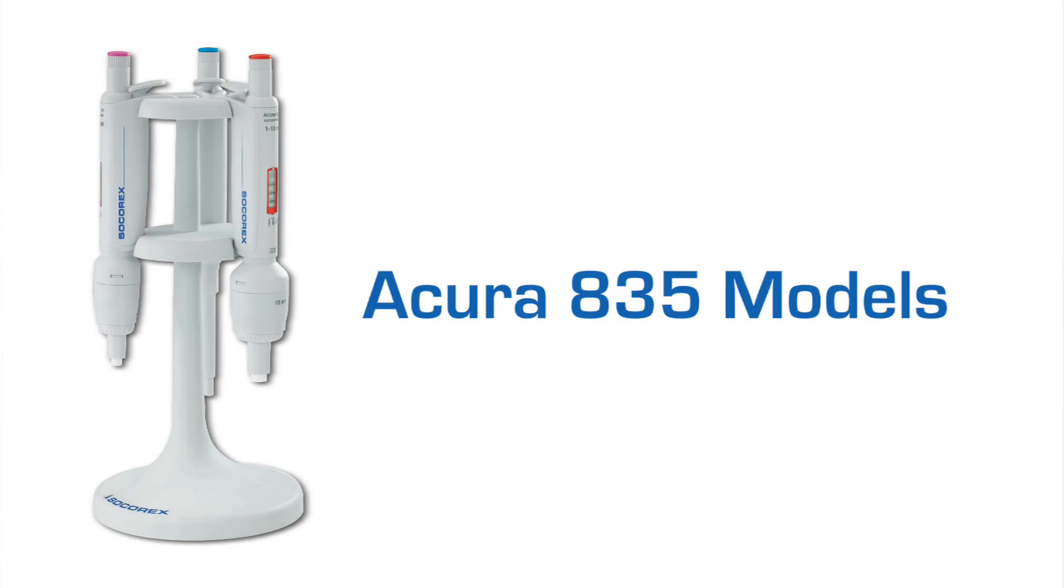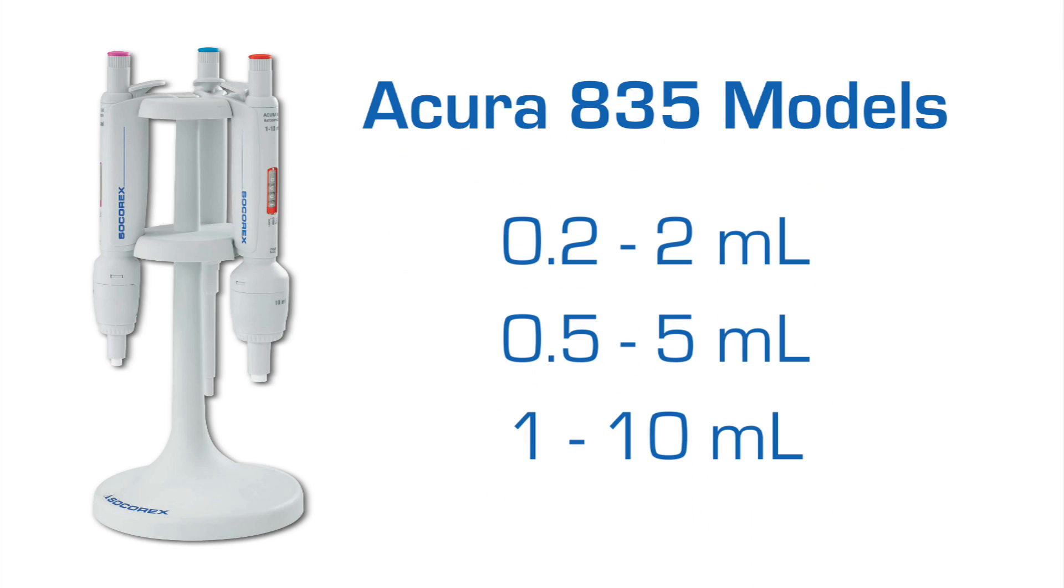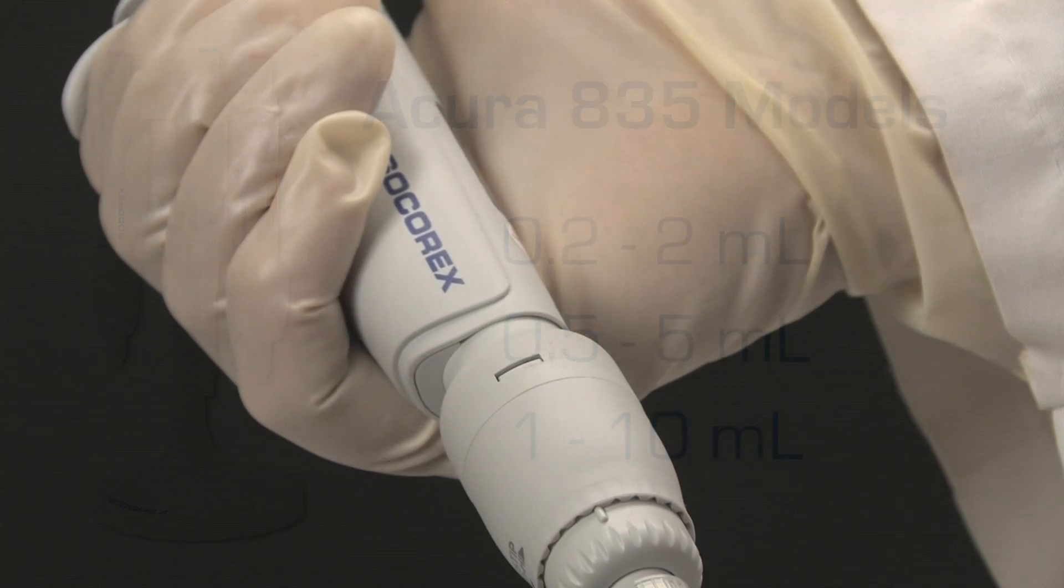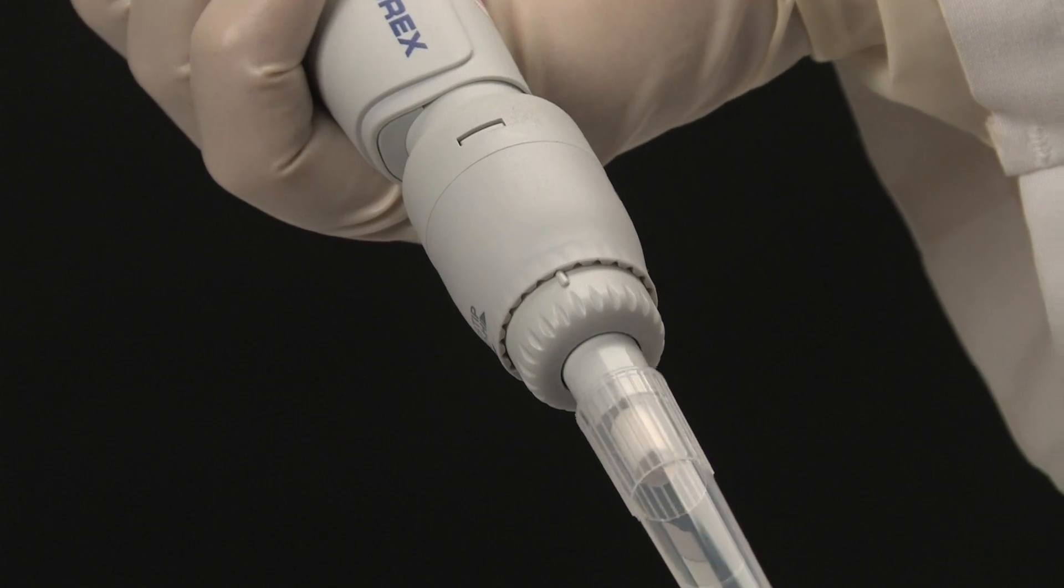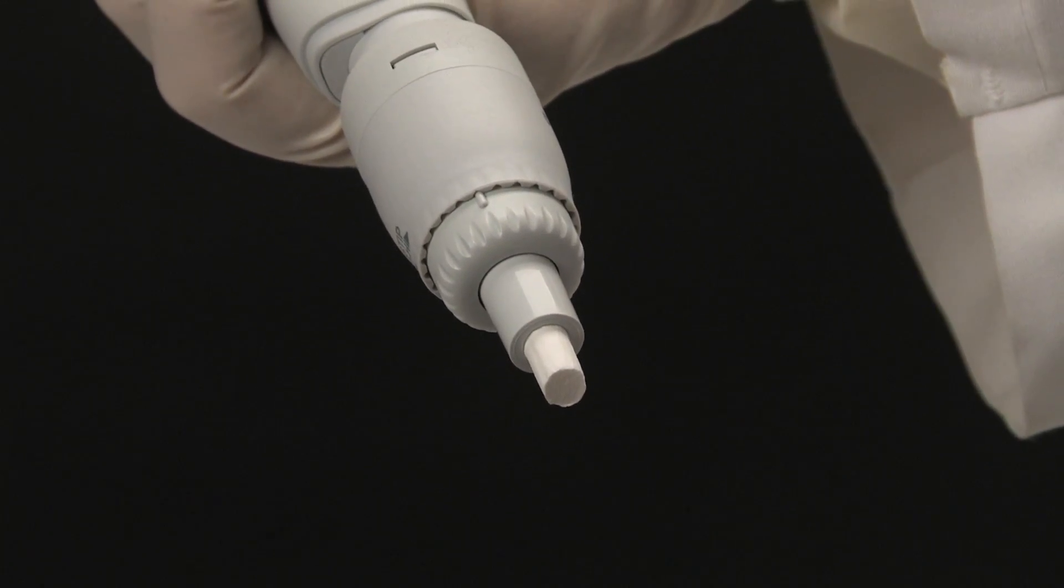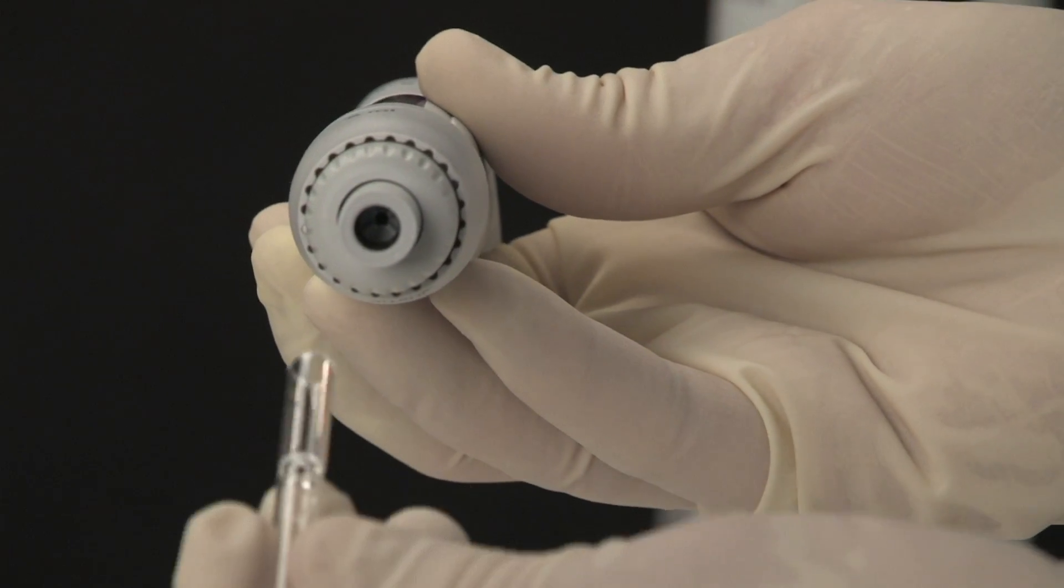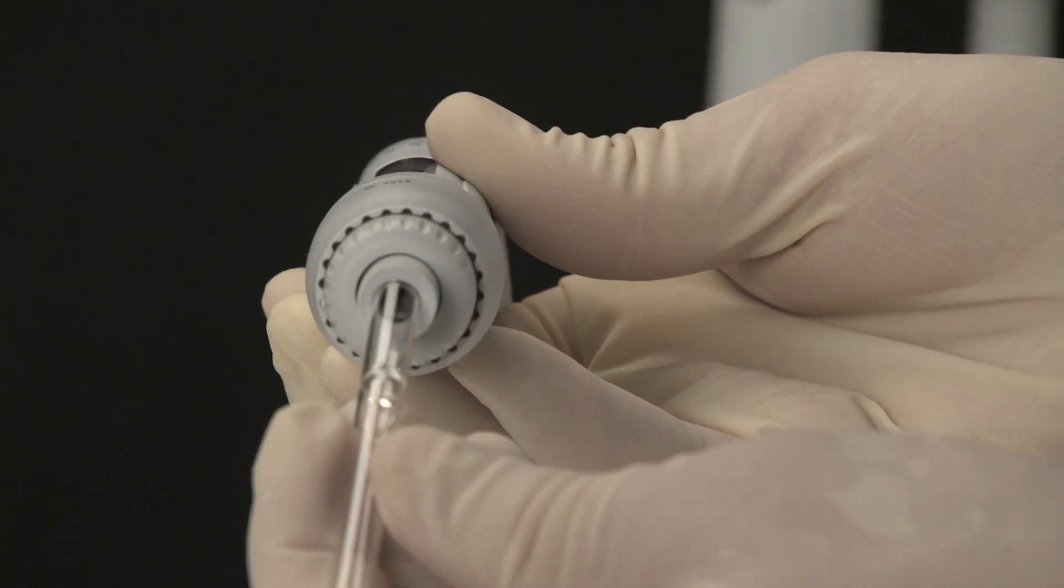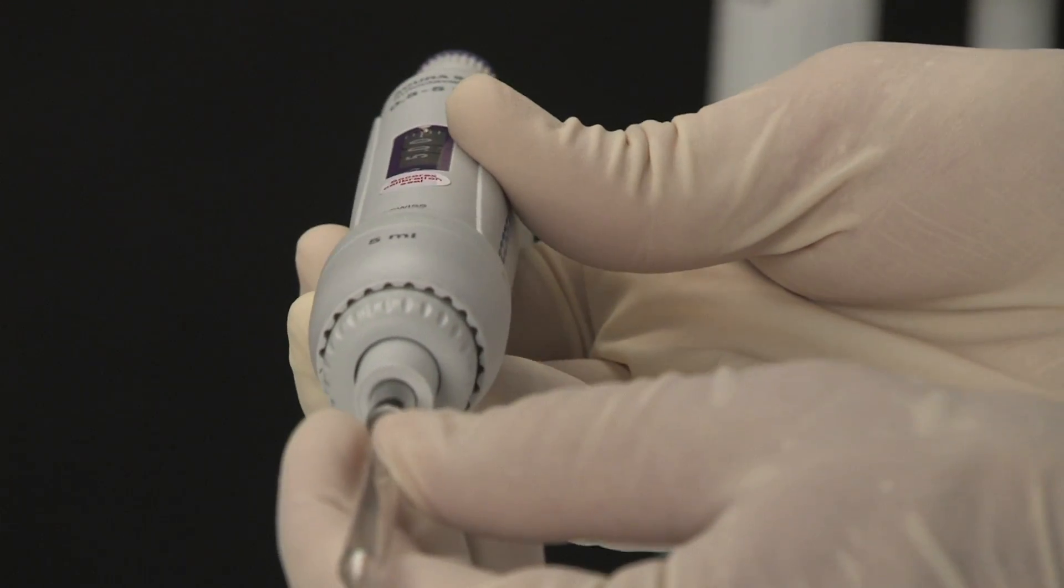The Acura Manual 835, which is offered in three sizes for larger samples, can accommodate nozzle filters for added protection against liquid fill and contamination. An optional adapter nozzle allows for the use of Pasteur pipettes on the 2 and 5 milliliter models.